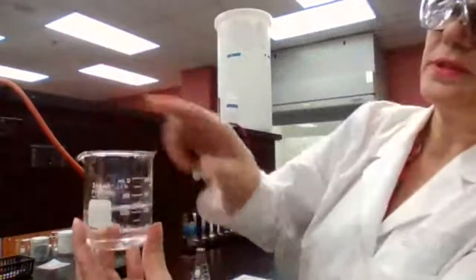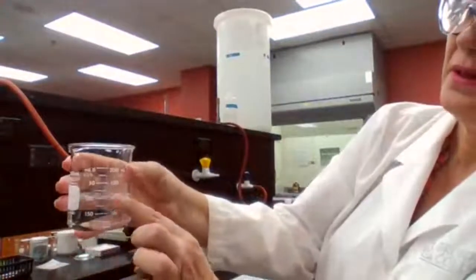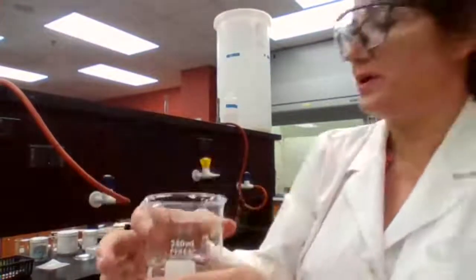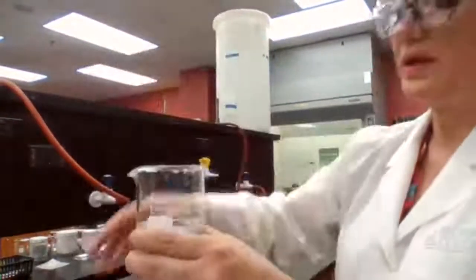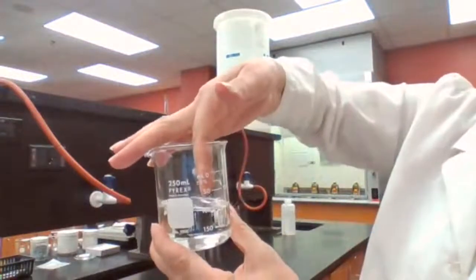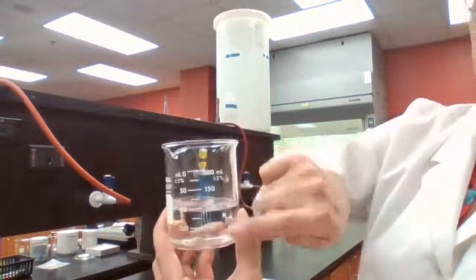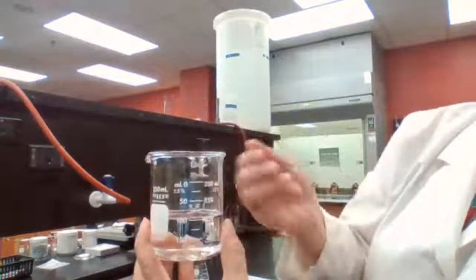There are again two numbers that show how much liquid you have in the beaker. This is how much you dispense out. It's starting from 0. Obviously, if it's filled up to this point, it's not zero volume. It's not helping much. So you have 0 here, and then you have 0 when there's nothing in here. When you are reading to find out how much liquid you have, you read from the side that is increasing down, up.